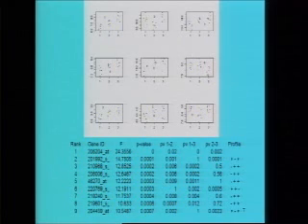Look at the rank 2 gene. The p value corresponding to the F test is 0.001, so it is again a significantly differentially expressed gene. And if we again look at the p values of the corresponding pairwise t test, the p value is 0.001 for comparing mu1 equal to mu2. It tells us that mu1 is not the same as mu2, but the p value corresponding to mu1 and mu3 is 1. These are Bonferroni adjusted p values. So it tells us that this rank 2 gene has more or less the same behavior in the first and third group, and that's also evident from our strip chart.